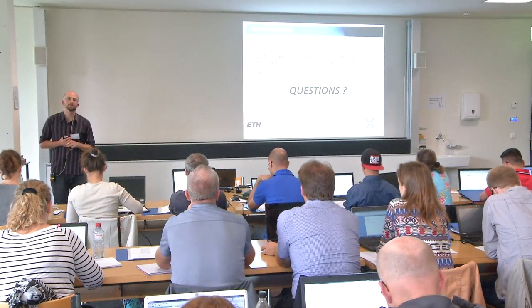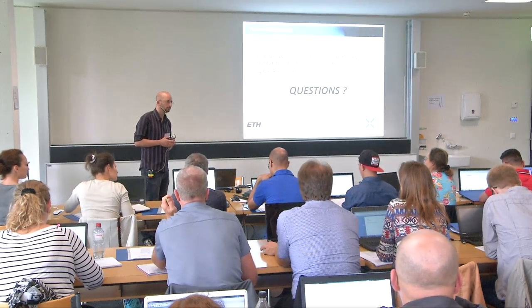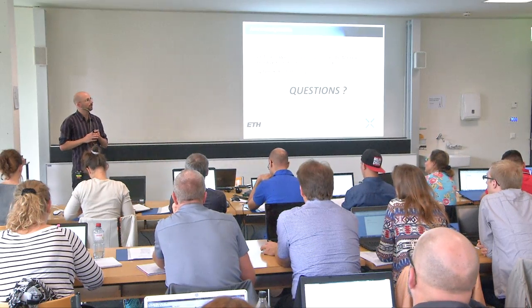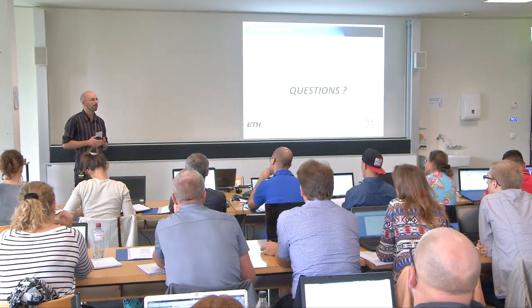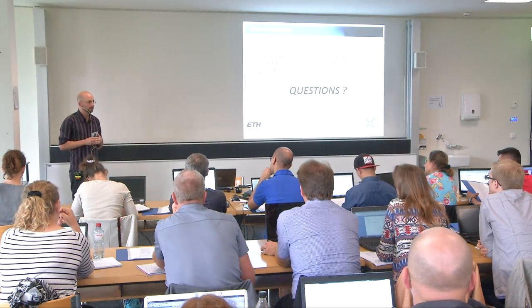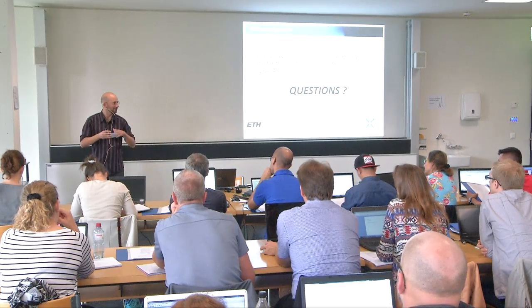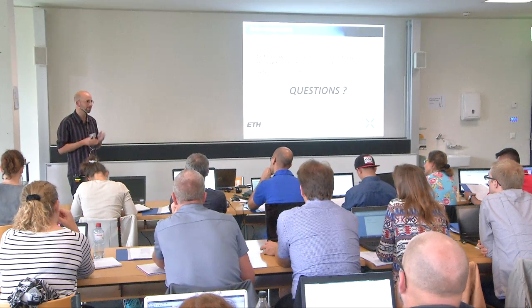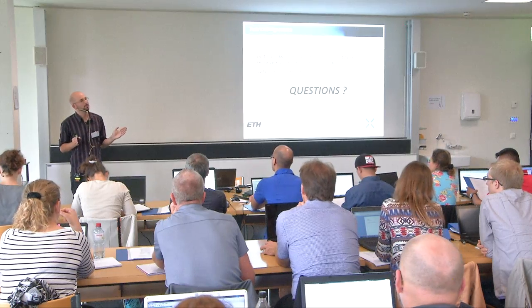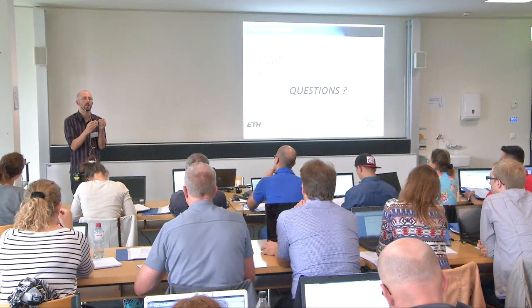More questions? In our lab, we always work with iRTs, not only in targeted, but in all the measurements that we do in the lab. And the idea behind it is that retention time, figure of speech, but not really, comes for free. It's always there. The kit doesn't come for free, but the retention time does. And if we have it in all the samples in the lab, we can always use it as a standard and always come back to these iRT values.